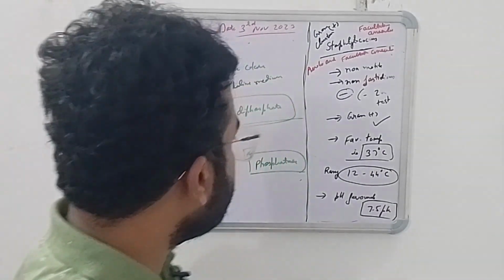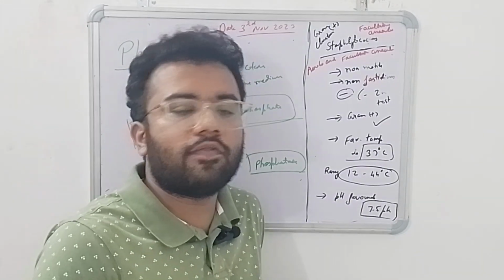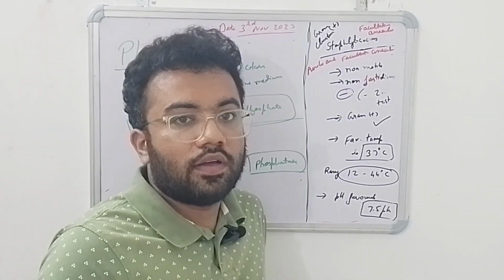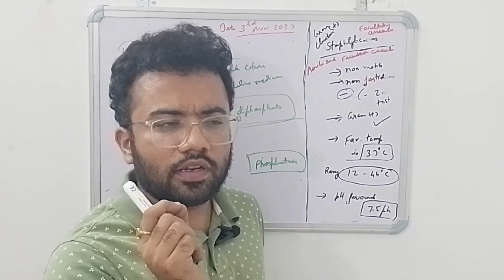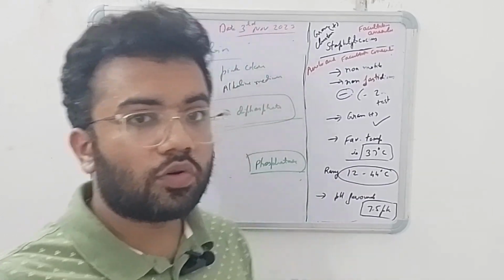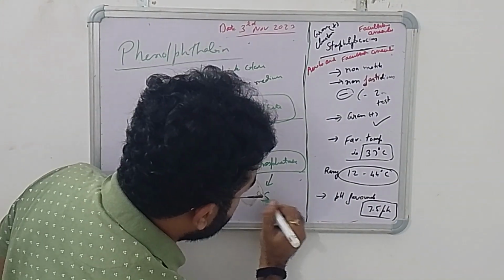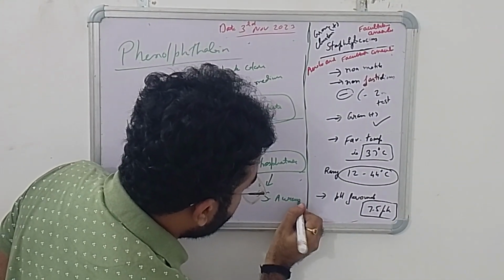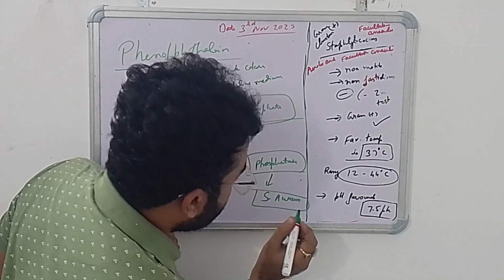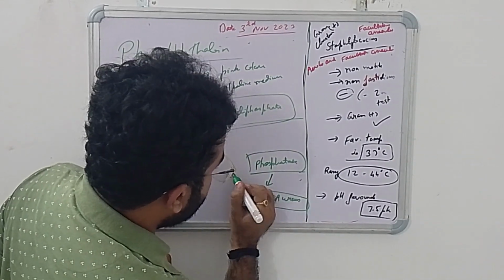The main thing is that phosphatase concentration is higher in Staphylococcus aureus. There is mild presence of phosphatase in epidermidis also, but a higher concentration is present in Staphylococcus aureus. So this golden yellow pigment organism contains more of the phosphatase enzyme.